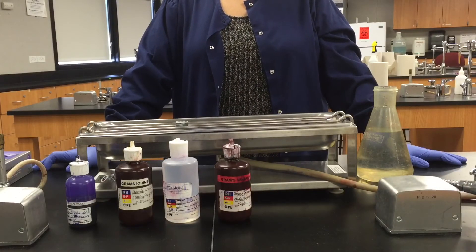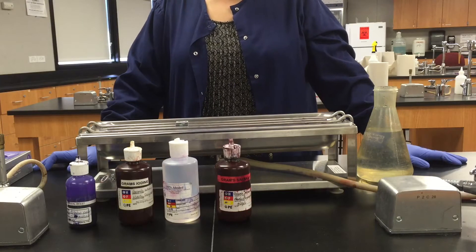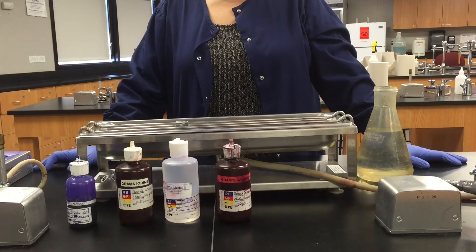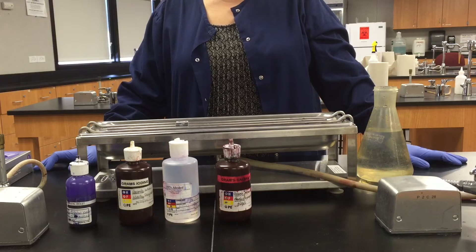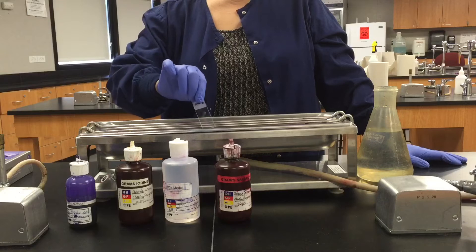Hi students, this is Professor Schimald and Renee, and we'd like to show you how to make a gram stain. You're going to begin with making an air-dried, heat-fixed smear, and I've discussed how to do that in a previous video.